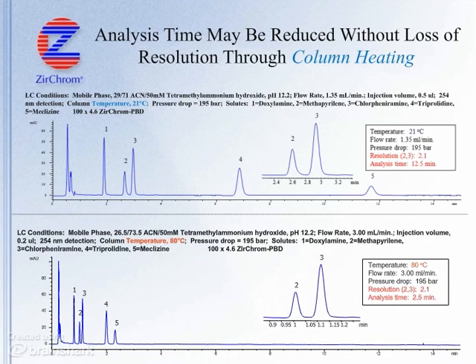This experiment is repeated at 80 degrees Celsius with even more dramatic results. Resolution between the critical pair is again maintained, and now, with a flow rate of 3 mL per minute, the full analysis is complete in 2.5 minutes.